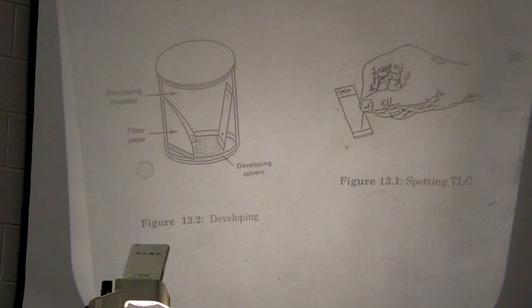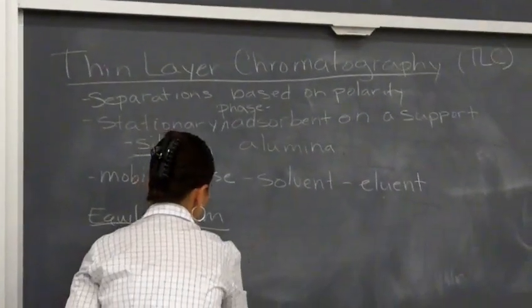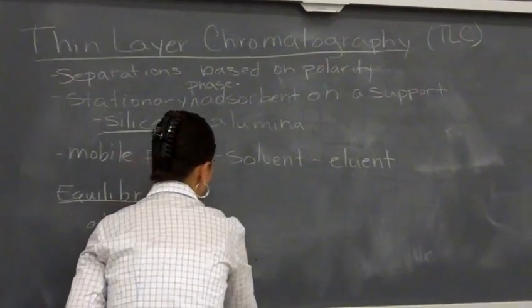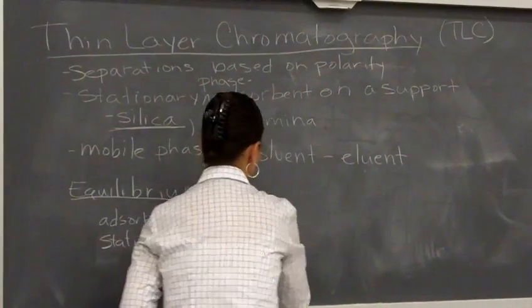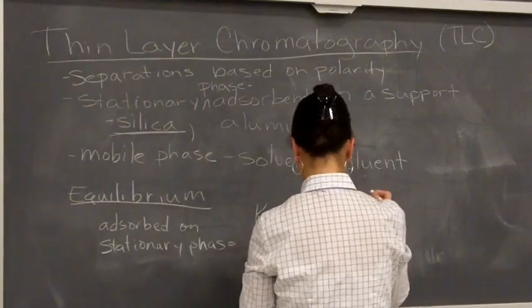so it's either adsorbed on the stationary phase or it is traveling with the eluent, okay?